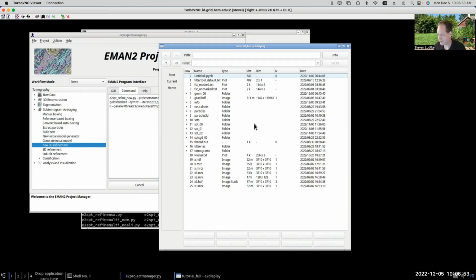It might help with the alignments just a little bit or something like that. So, there might be some strategy where making some use of them is still warranted. Generally speaking, though, your strategy, if you're planning to target high resolution subtomogram averaging, should be to use lower total dose in your tilt series data collection, use a higher tilt step to get better quality individual tilt images so you can get better quality alignments.